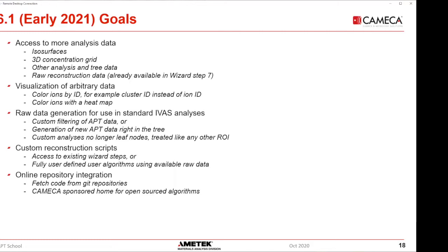And also, we are going to launch our online custom analysis repository with 6.1.